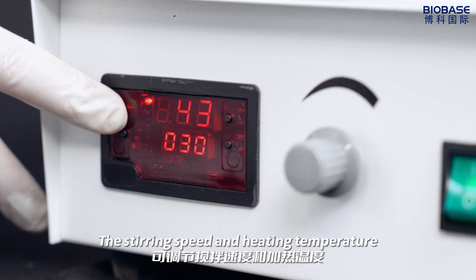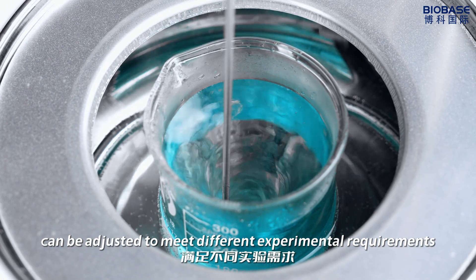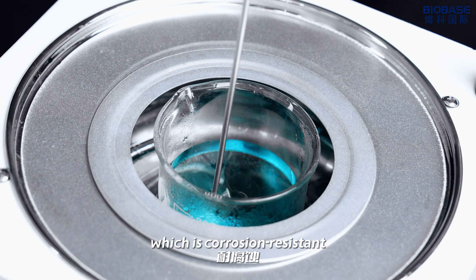The stirring speed and heating temperature can be adjusted to meet different experimental requirements. The inner liner is made of high-quality stainless steel, which is corrosion-resistant.